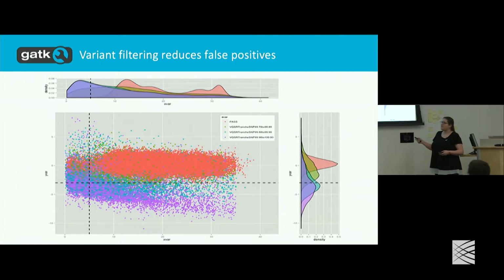So here we're using VQSR, the variant quality score recalibrator, which is saying that all of the red dots here are really high quality, and then we get lower and lower quality as we move away from that cluster. And we're also going to learn more about some deep neural nets that are also in the mix for making our variant filtration step in the coming days.